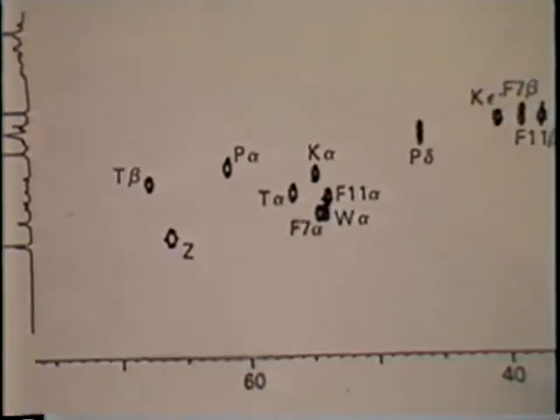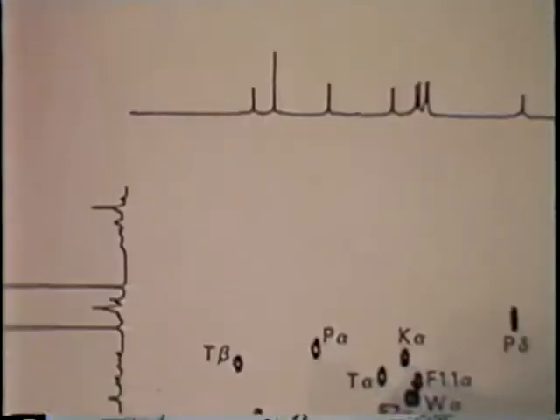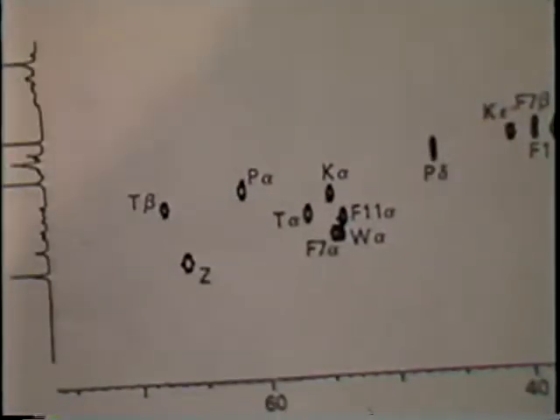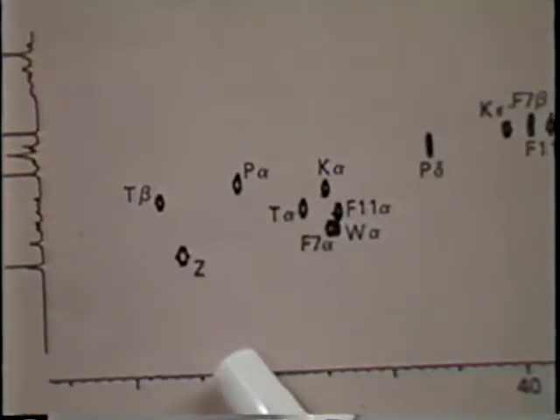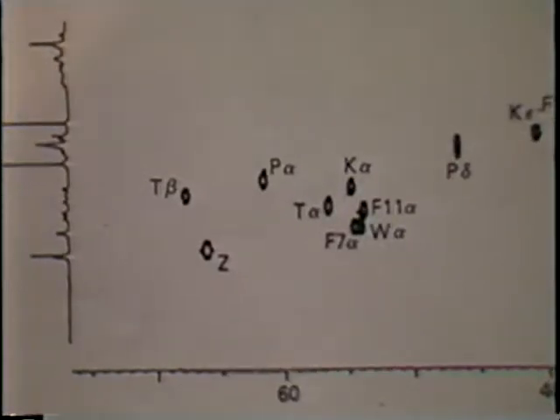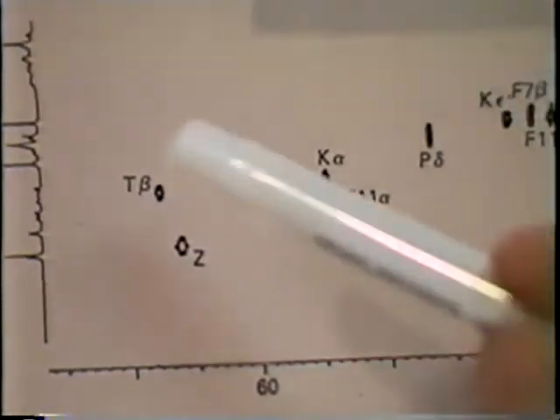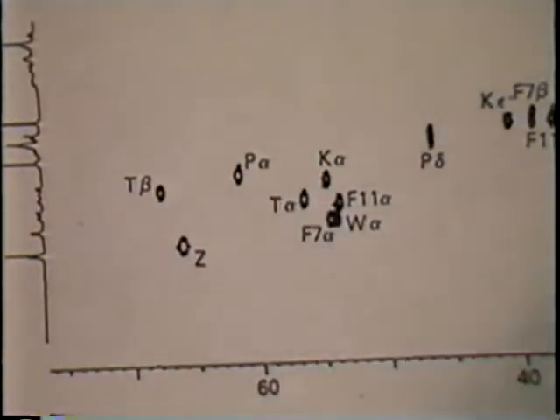That one can then relate various carbon sites to various proton sites, frequencies, and this helps us in assignment as well as in confirming our molecule that we have synthesized, for example. And you will notice one or two things. Let's see that there is a slight broadening in the omega-1 direction, in the proton frequency, and I will come to it later.